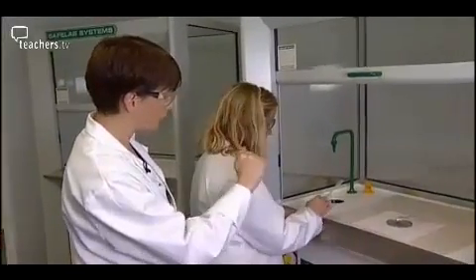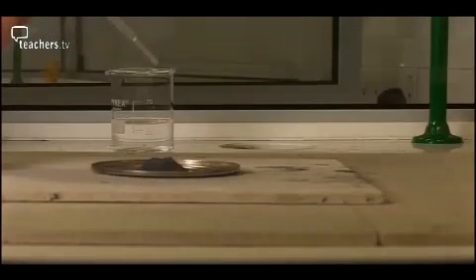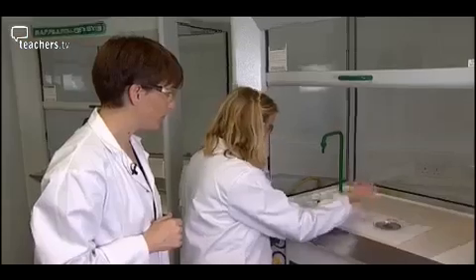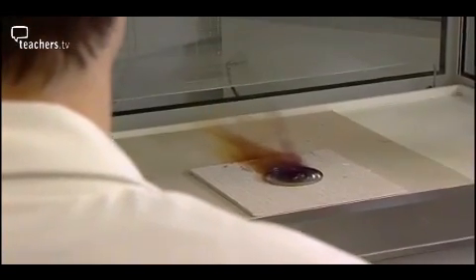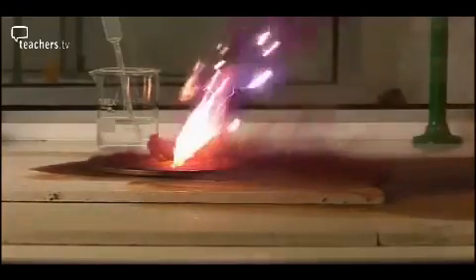What you need to do now is put two or three drops of water into the centre of the powder heap. Once the water is added, stand back and wait for the action. It may take a minute or so, but there will be plenty of iodine vapour, so turn the fume cupboard on. There we go — and off it goes.